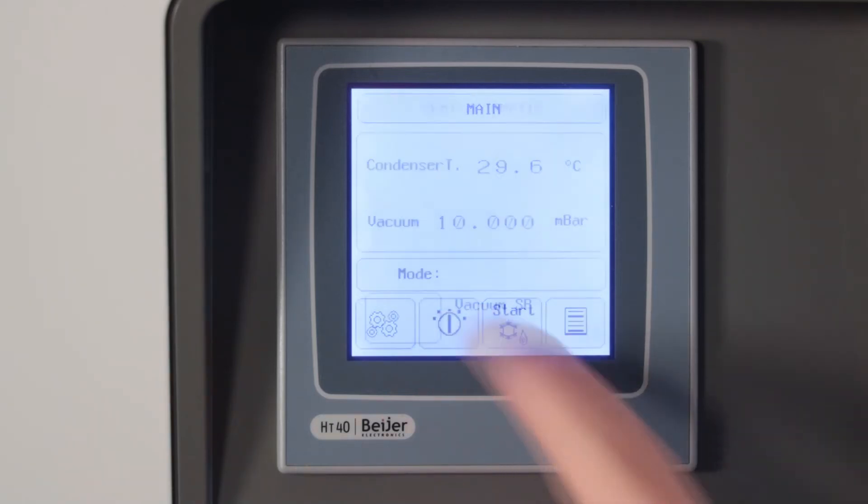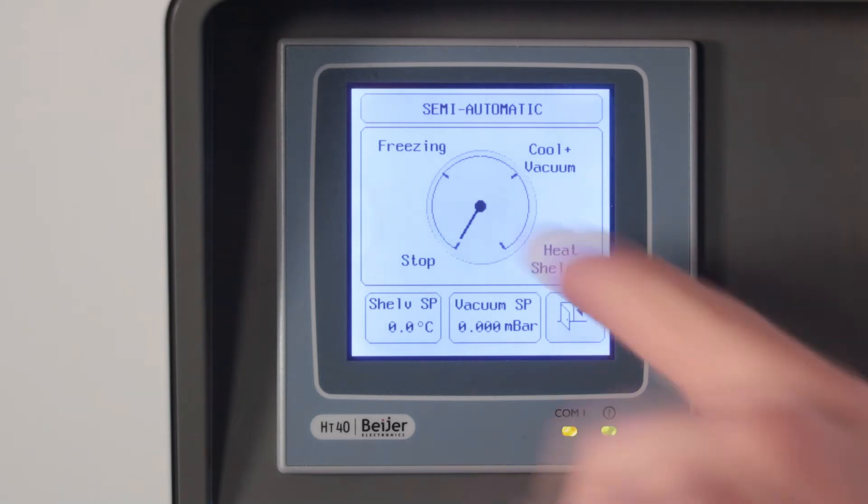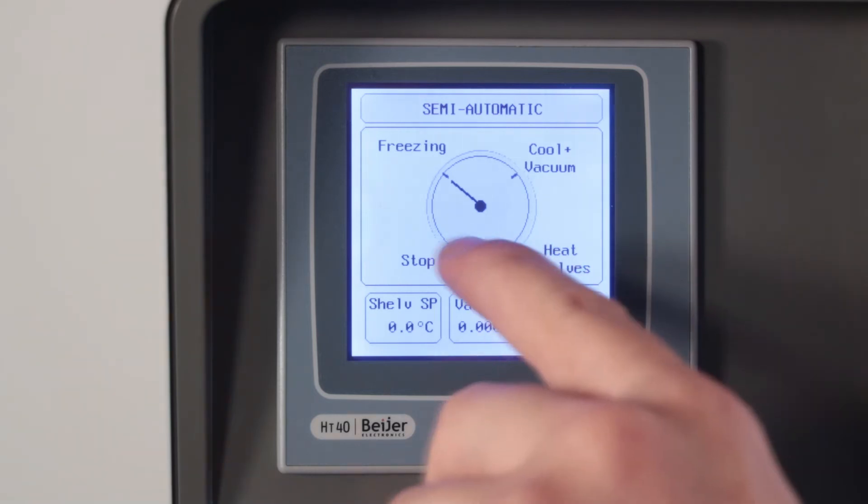This is the semi-automatic mode where you can select the process you want: stop, freezing, cool vacuum, heat shelves. Press this button to start or to stop.